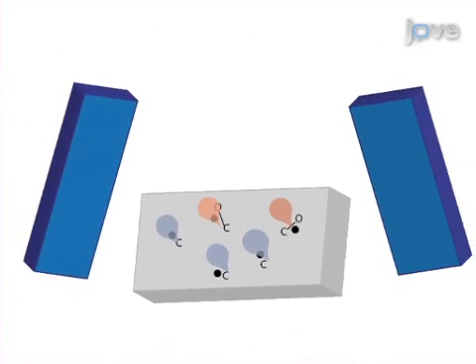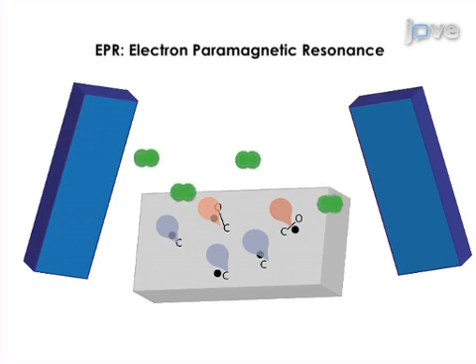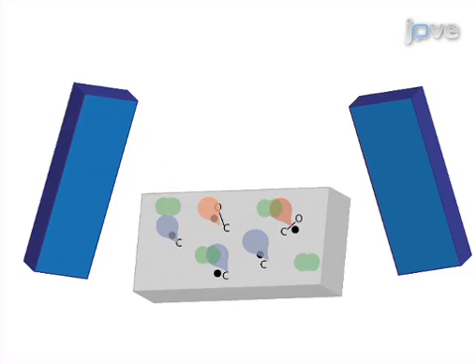As a second step, a diamagnetic gas flow is flushed through the samples, and the nature of the carbon radicals is detected by EPR spectroscopy, which characterizes the nature and rate of formation of carbon radicals in an inert environment.